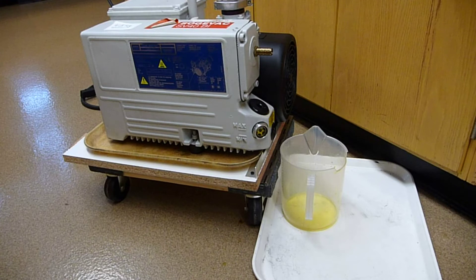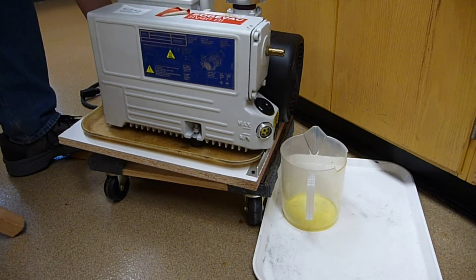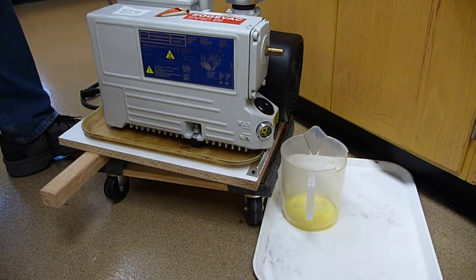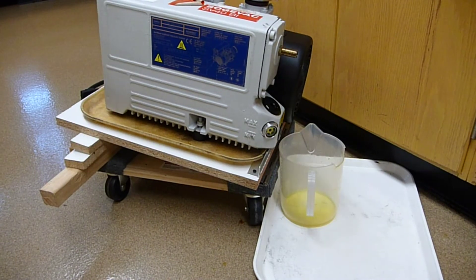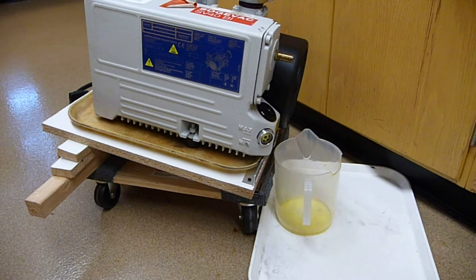Next, I'm going to elevate the end of the wood that is not connected to the hinge. I'm going to step on here, use the mechanical advantage, and stick it up. There's a 2x2 there. I'm going to stick another piece of wood a bit higher, so I have a couple more spacers increasing the incline.